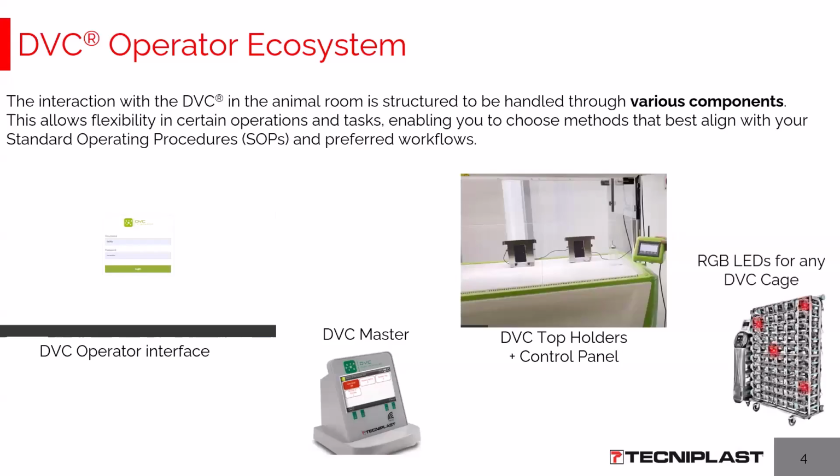Last but not least, and originally this has been our first interface since the beginning of this project, the DVC board is equipped with red, green, and blue RGB LEDs. You can play with them, interact, searching for cages, and providing feedback. This is also not a real graphical interface, but for sure it's a point of interaction with the final user, extremely powerful.